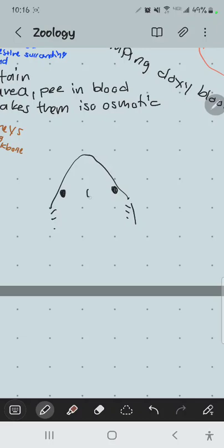That's the top of the cranium, right between the eyes. Anyway, you're going to take a scalpel, and rather than cutting down like slicing, you're going to slice like you're whittling a stick. You're shaving off the top of the cranium of the shark.